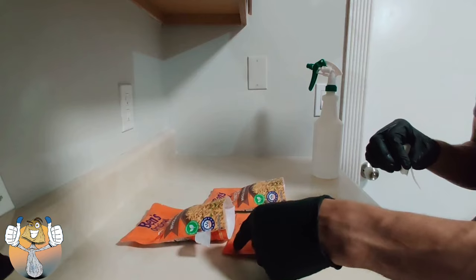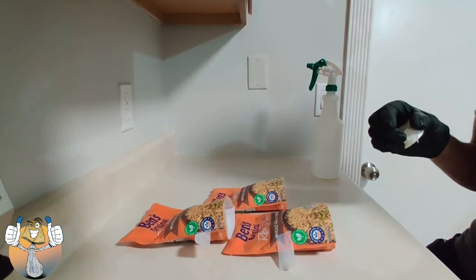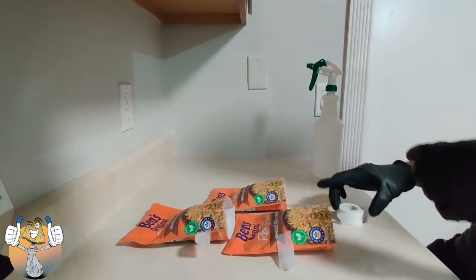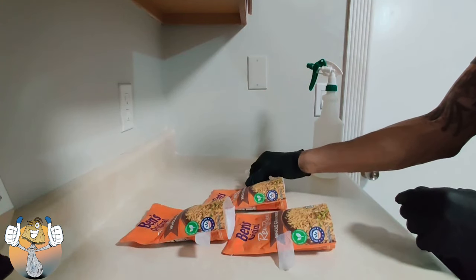We're going to start by just pre-staging our micropore tape so that once we have our holes on the bag we don't have to go reaching for the tape. It's a little sticky with the gloves, so we're just going to put those on the side until we're ready for them.